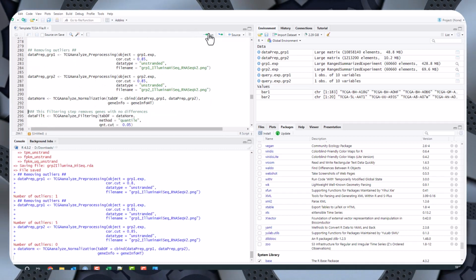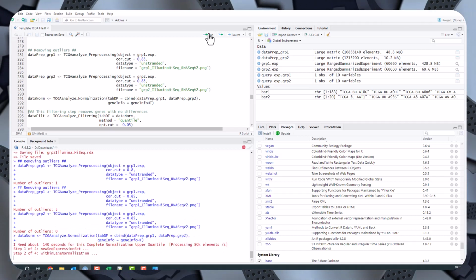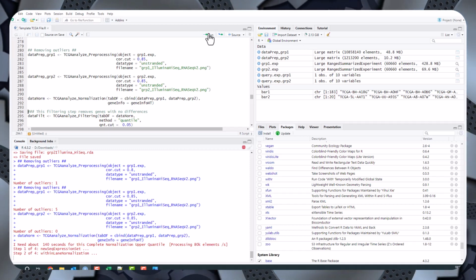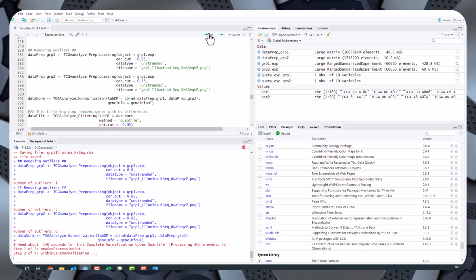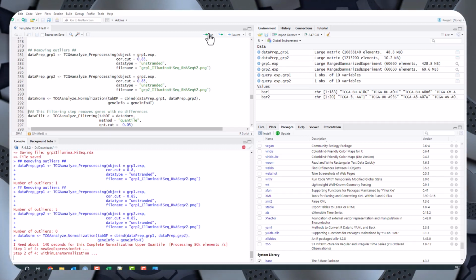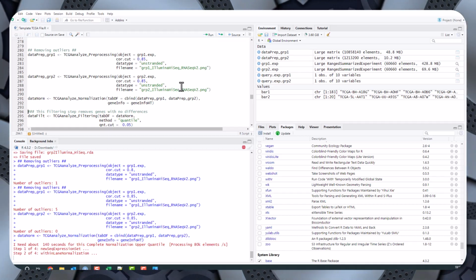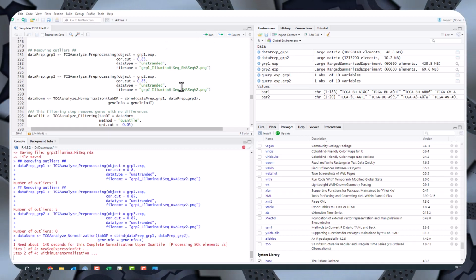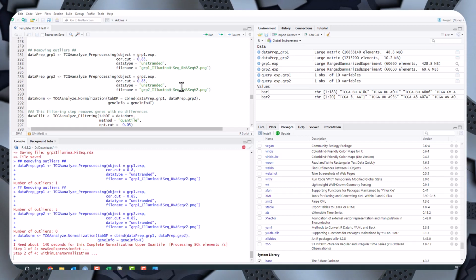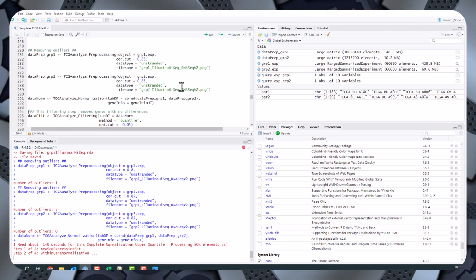So what you do is run normalization, and what that does is it makes sure that all of the samples end up with the same baseline or at the same intensity. Because if you're comparing how much of something there is between two different samples and they're at different intensities, then for the most intense one there's always going to appear to be more, even if there isn't. So the first thing you need to do is get the baselines sorted. This will take the two separate data sets and put them together on a single standard.